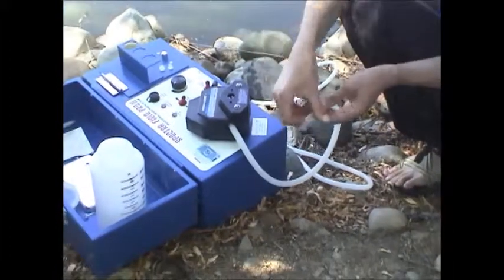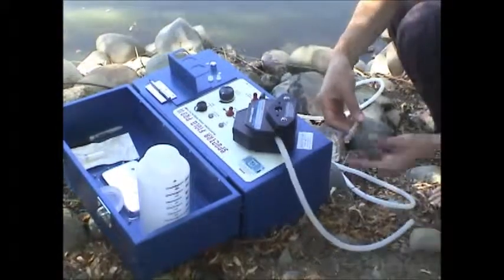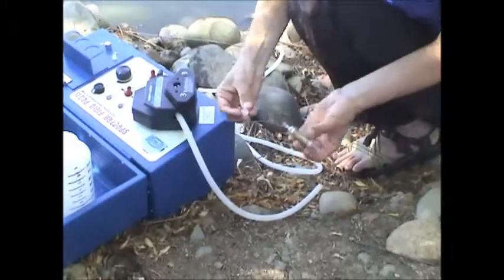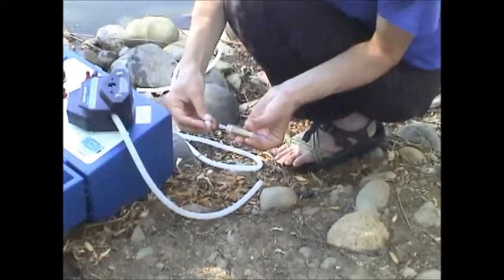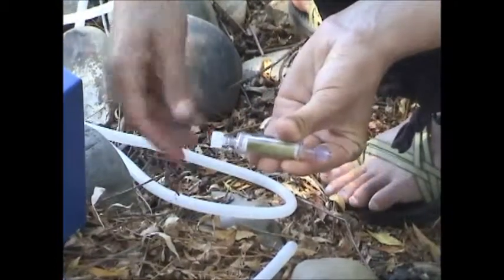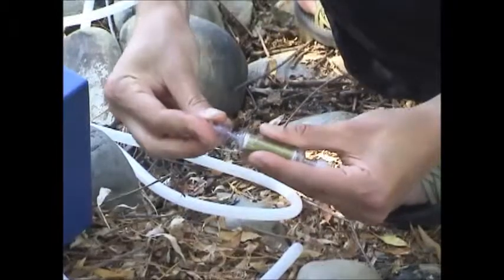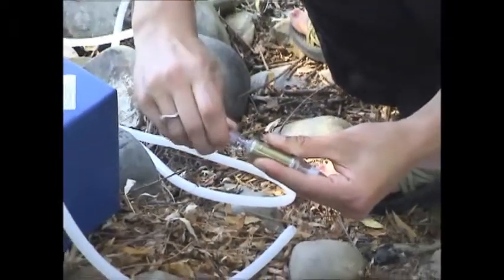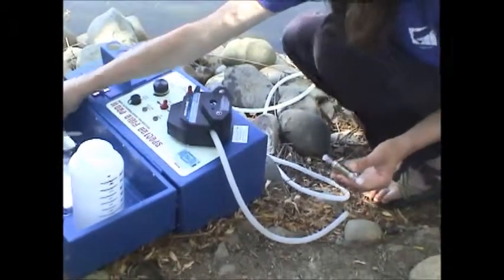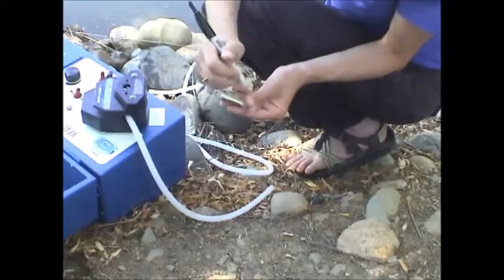Turn the pump off and now you just put on the end caps. Once you've got the end caps on, put that column on ice and you're done. You might want to record specifics about the field site and field ID.